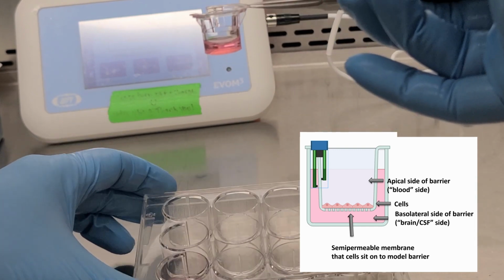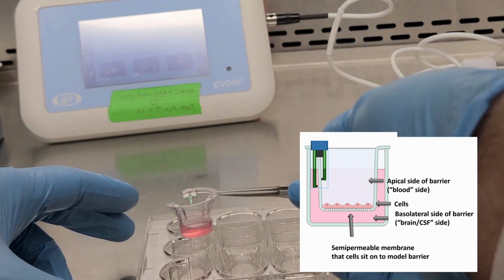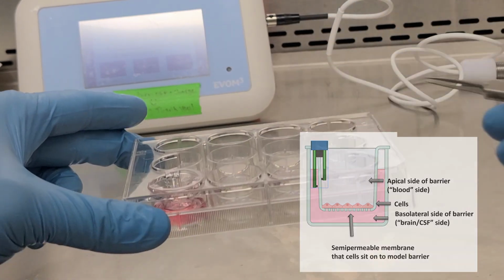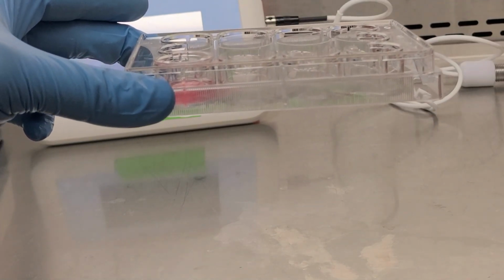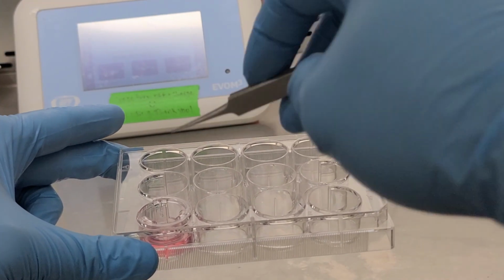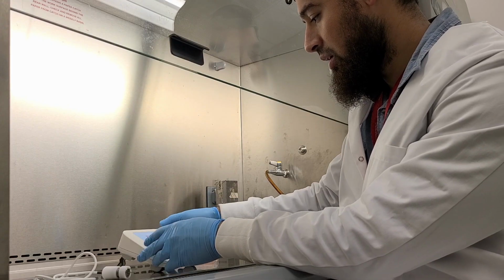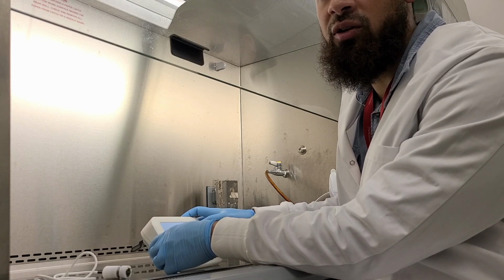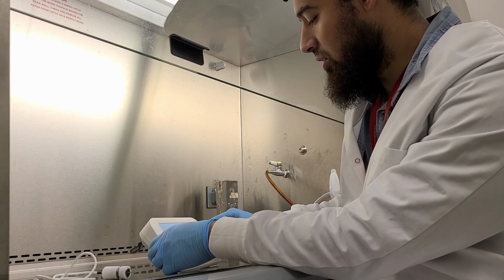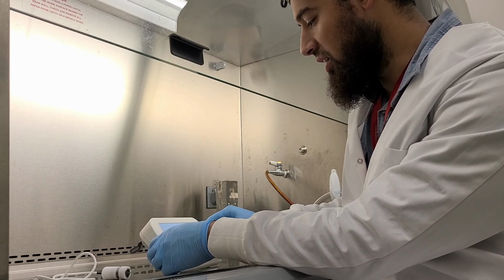The cells are sitting on the bottom of this well. And once you put it in here, you essentially have two compartments. You have the top and the bottom, separated by the well insert. And that's how we model the barrier in vitro in cell culture. What I'll be doing right now is measuring trans-endothelial electrical resistance, or TEER, which is essentially a measure for barrier integrity.